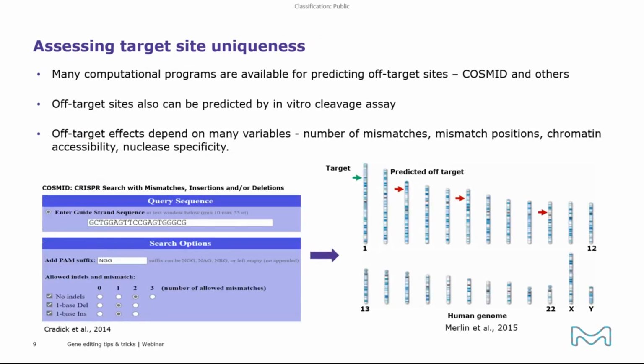Target selection is an important step in CRISPR gene editing experiments because of the concern over off-target effects. In a complex genome, such as the human, chances are you will often find similar sequences for a given Cas9 binding site. Fortunately, there are several computational programs to help you identify potential off-target sites.